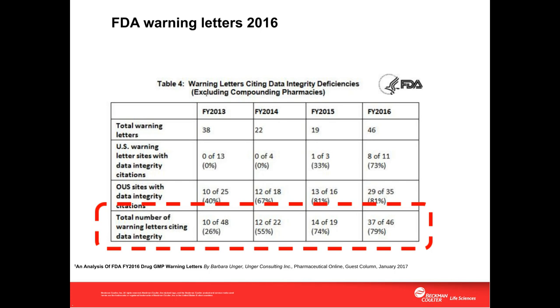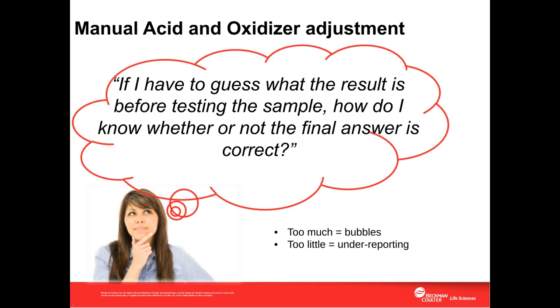Now, any process that automates the quality control SOP can potentially both reduce the impact of human error on data integrity issues and also brings welcome savings by reducing the time technicians need to devote to carrying out the SOP itself.